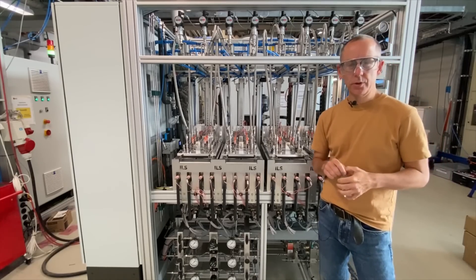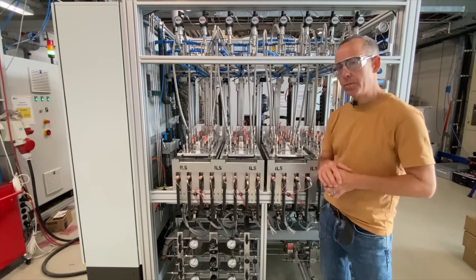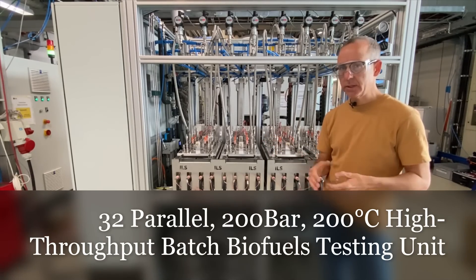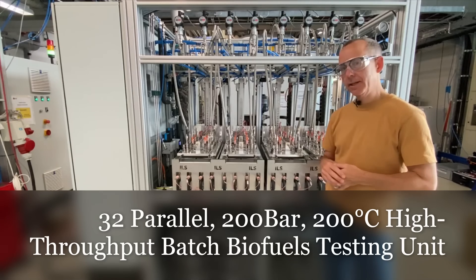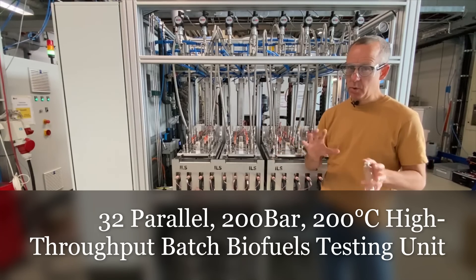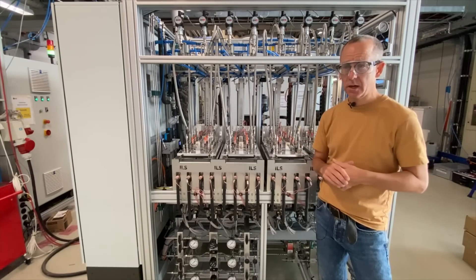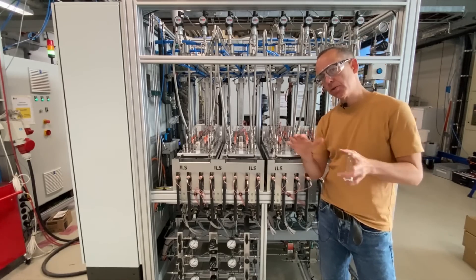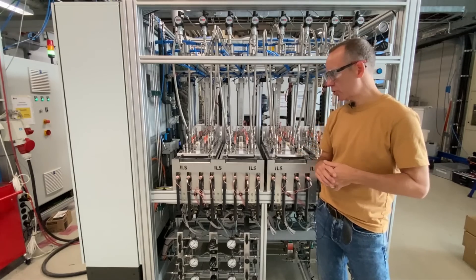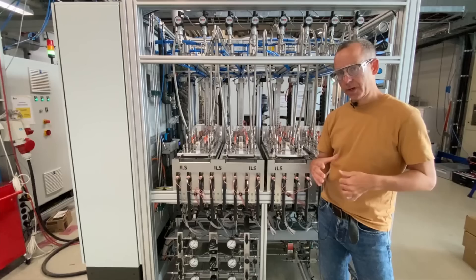In today's video I'll be introducing you to our latest parallel batch unit. This is a high-throughput batch testing system specifically designed for lignocellulose upgrading. Lignocellulose is known as being one of the more difficult components of a lot of biomaterials like wood-based feedstocks, requiring often high temperatures, pressures, and fairly corrosive acidic environments to actually access the cellulosic material, which can be broken down into biofuels or chemicals.